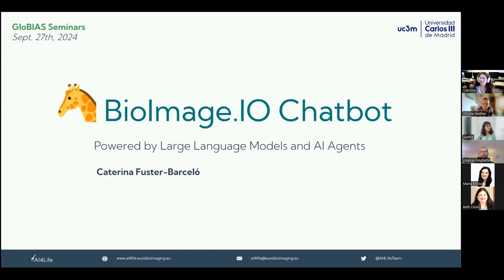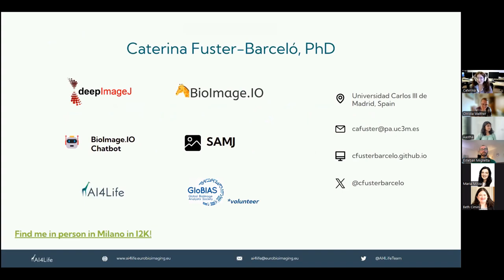Thank you very much to GloBIAS for letting me have this opportunity to present here the Bioimage Chatbot. Welcome everybody. Good morning or good afternoon, depending on where you're connecting. Let's start. I've already been presented very well. I'm also part of other projects such as DeepImageJ, which is a Fiji plugin for bioimage analysis, the Bioimage Model Zoo, which I'm going to explain a bit to give you context for the bioimage.io chatbot, and the bioimage.io chatbot itself, of course.